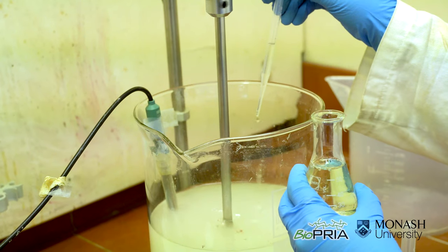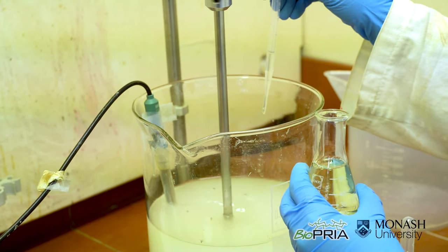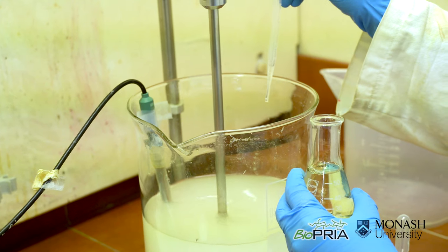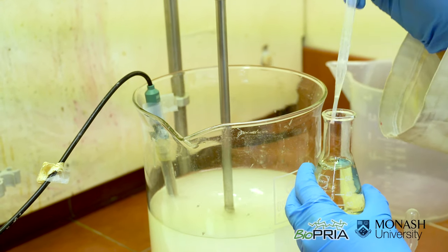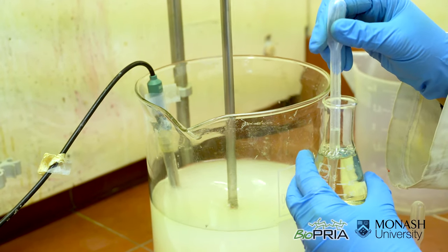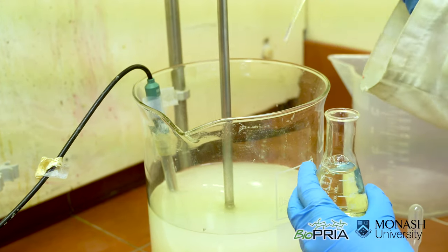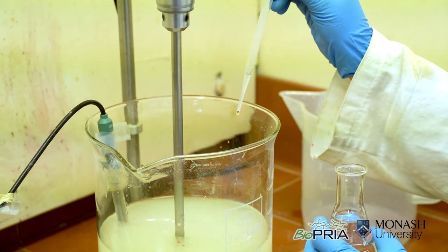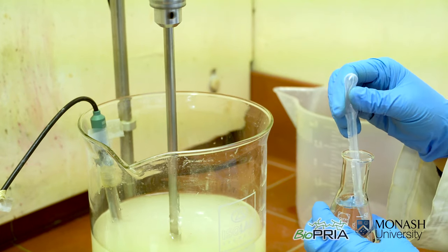Now we are ready to start the oxidation reaction by adding 75 ml of sodium hypochlorite drop wise. This reaction takes around 2 hours. We need to maintain the pH at 10 by adding 0.5 molar sodium hydroxide.